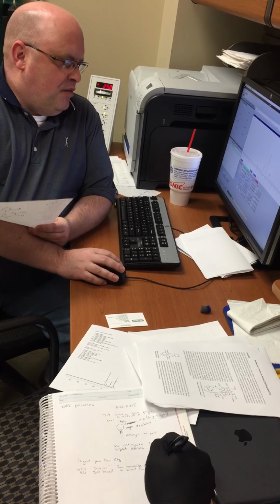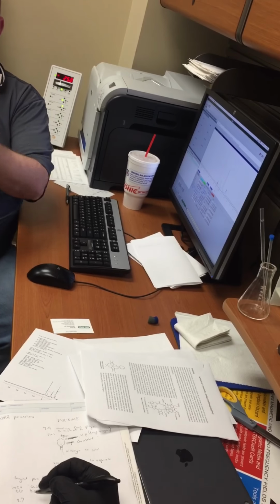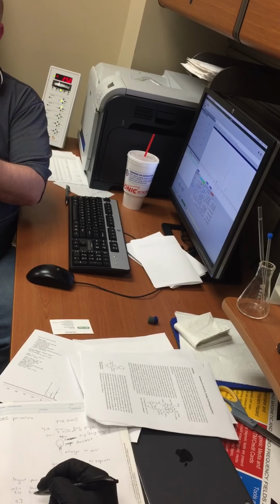Then we have this signal right here. This signal is not obvious, but remember the dimethylglyoxime has 2 acidic hydrogens. Only one of them comes off when it binds. And so we have 1, 1. So this signal at 2.7 is for the dimethylglyoxime's hydrogens.